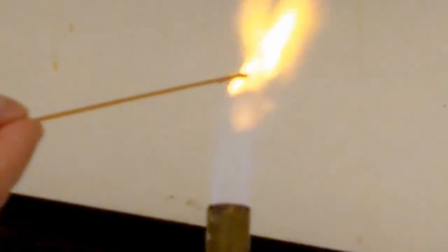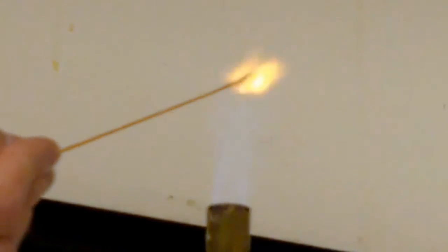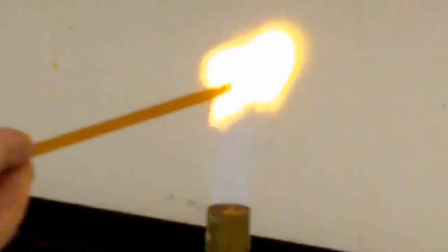Then we have sodium chloride, which gives off a very bright orange color as the sodium ionizes.